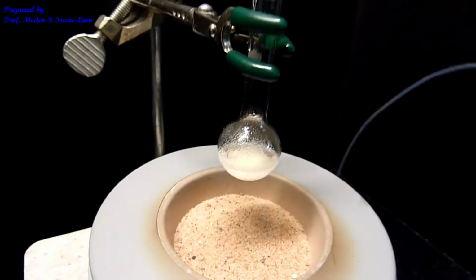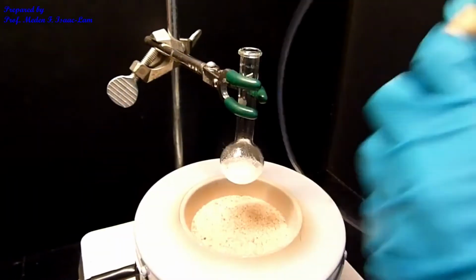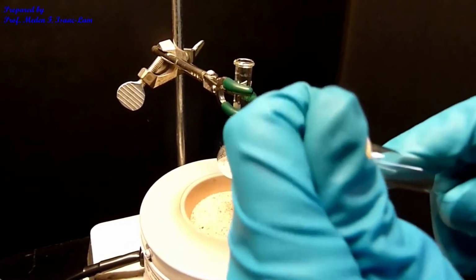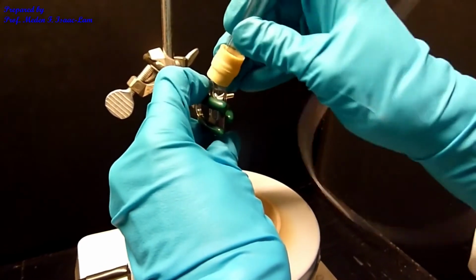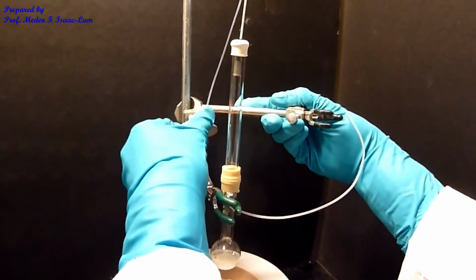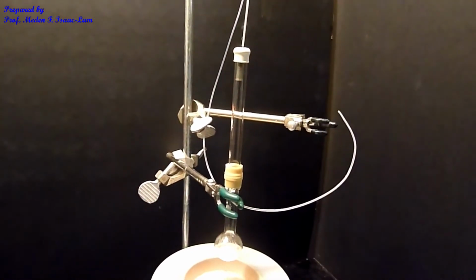So I'm now going to attach the air condenser that I assembled earlier, and I also have the adapter in here. So I'm going to attach the rubber adapter, and it will snap gently, and I'm going to attach it on top. So I'm going to attach the trap. So this is a micro scale trap of the HBr that is being generated.